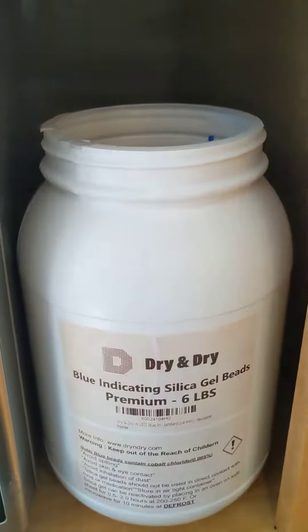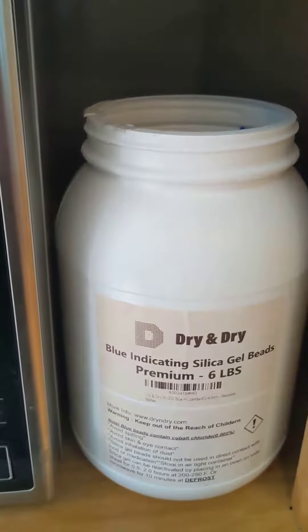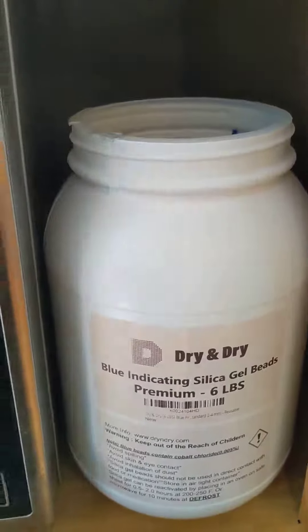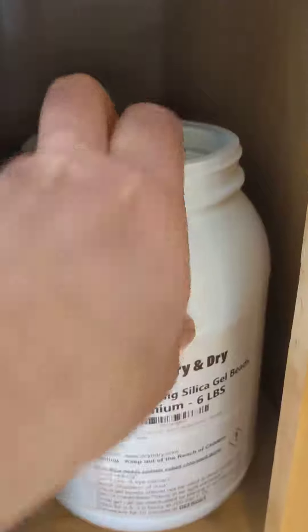However, the preference of course is to buy a commercial indicating silica product that you can regenerate, so that you know when it's drying and when it's not, and reuse it.